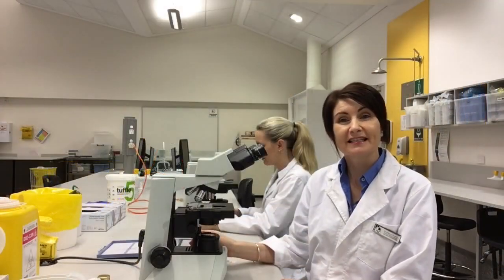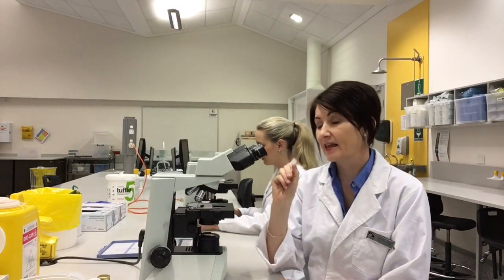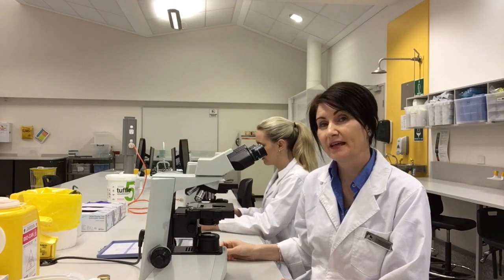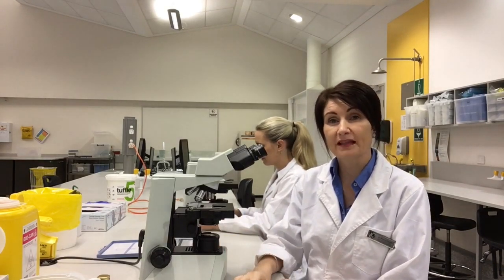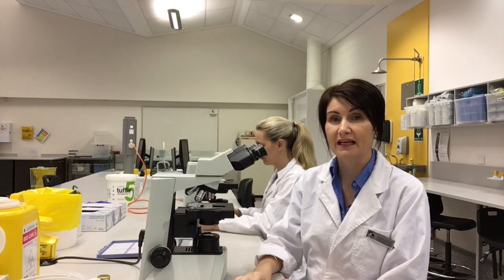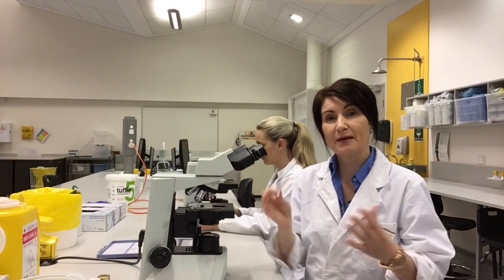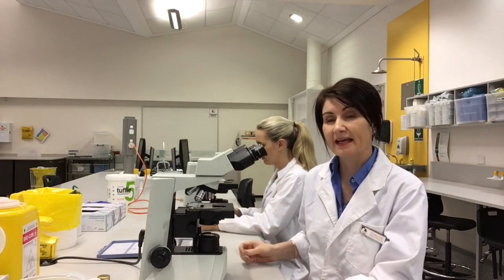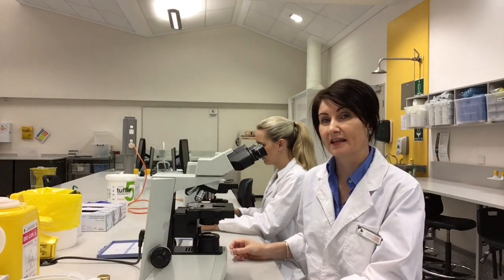Have you ever wondered how we get a piece of tissue onto a glass slide so that we can view it down the microscope? Well, I'm going to take you through the processing techniques and the equipment that's used in a pathology laboratory that actually makes these glass slides, so that we take a big piece of an organ and we make it as thin as a piece of paper so that we can view it under the light microscope.